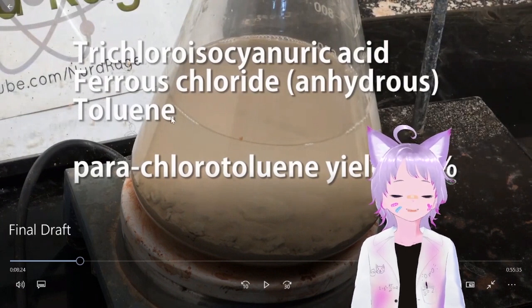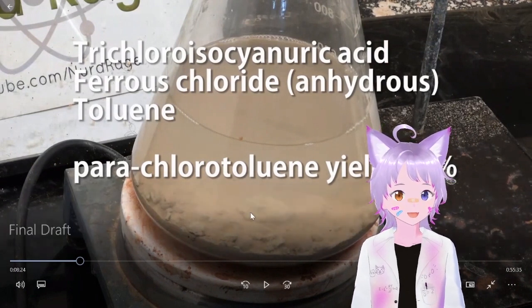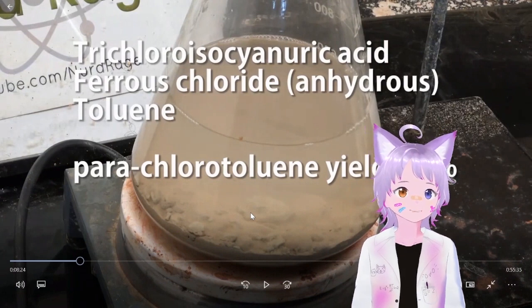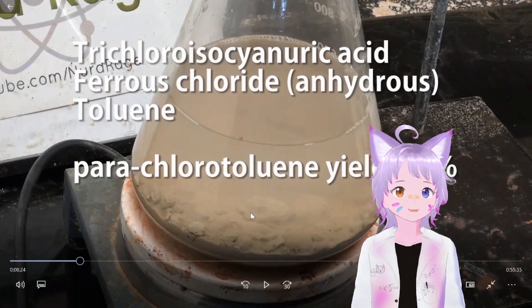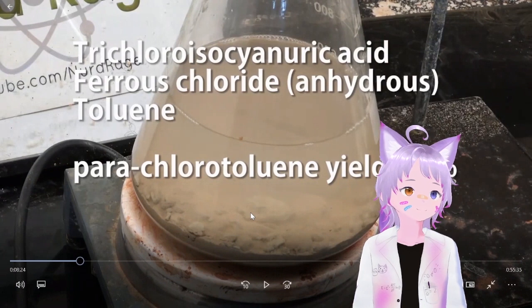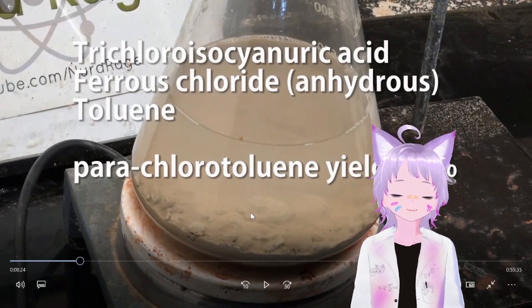I also wonder, when he does this reaction, is the ferrous chloride recoverable? Because I don't think it is, because you're technically reacting TCCA and toluene. What does it form though? Yeah. Honestly, I don't think it matters.